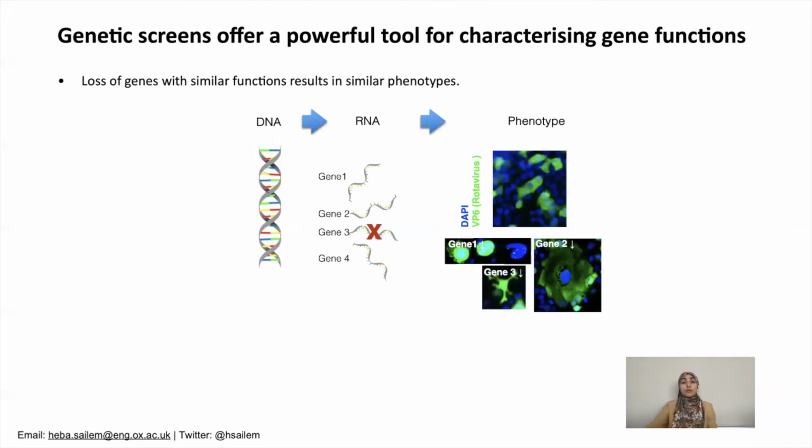If we do this for every single gene, then we can start linking genes that have similar phenotypes and say that they are functionally related.